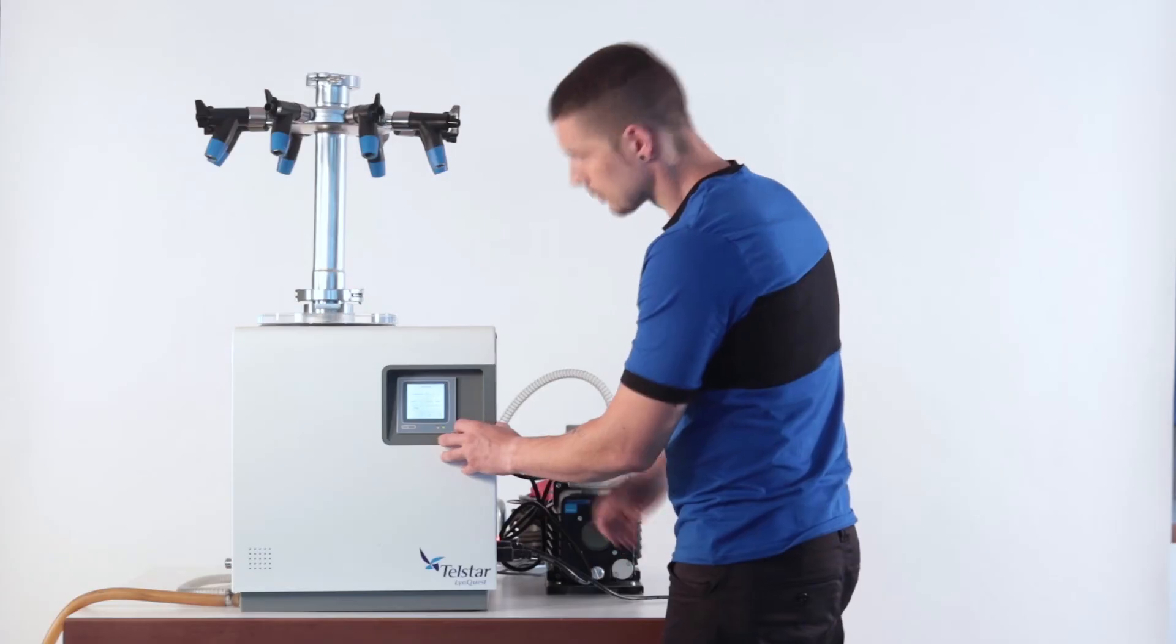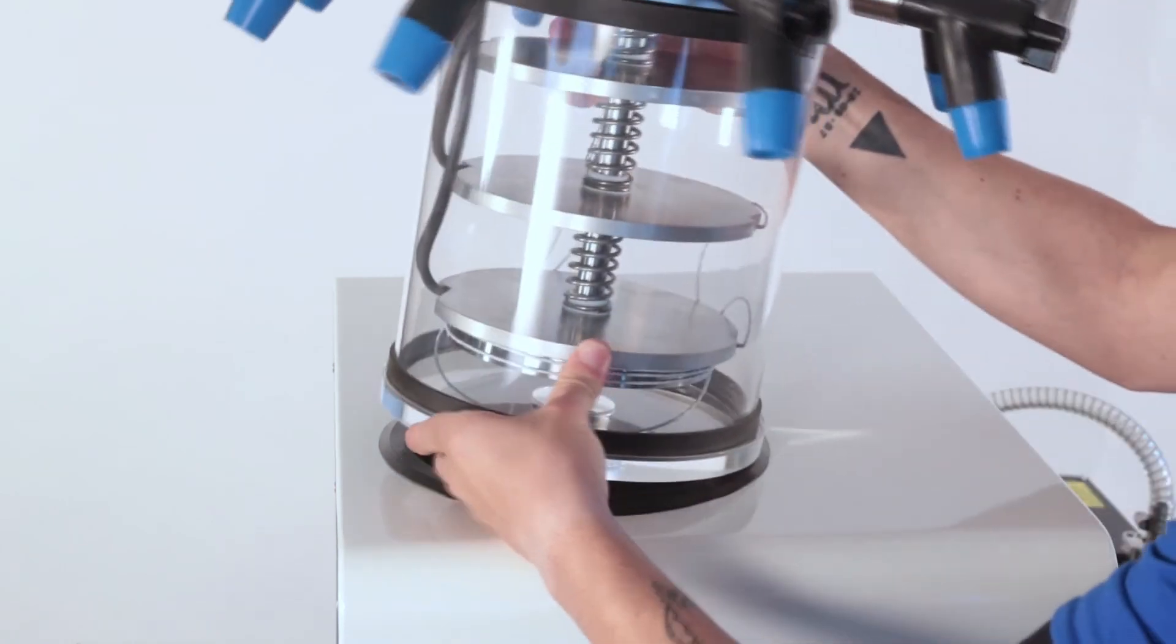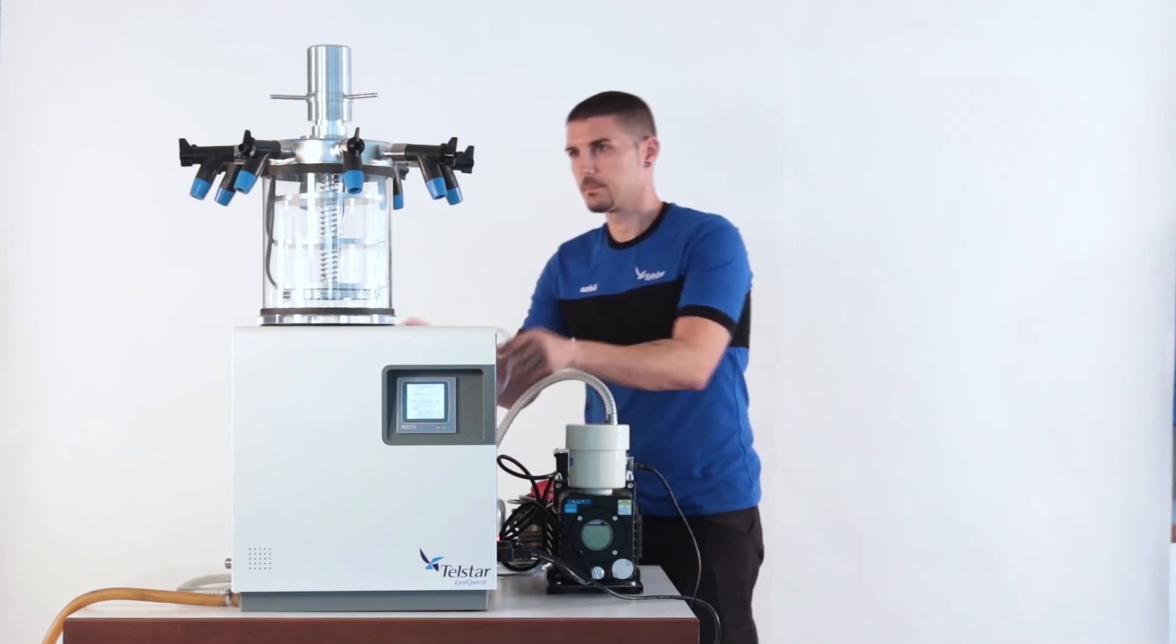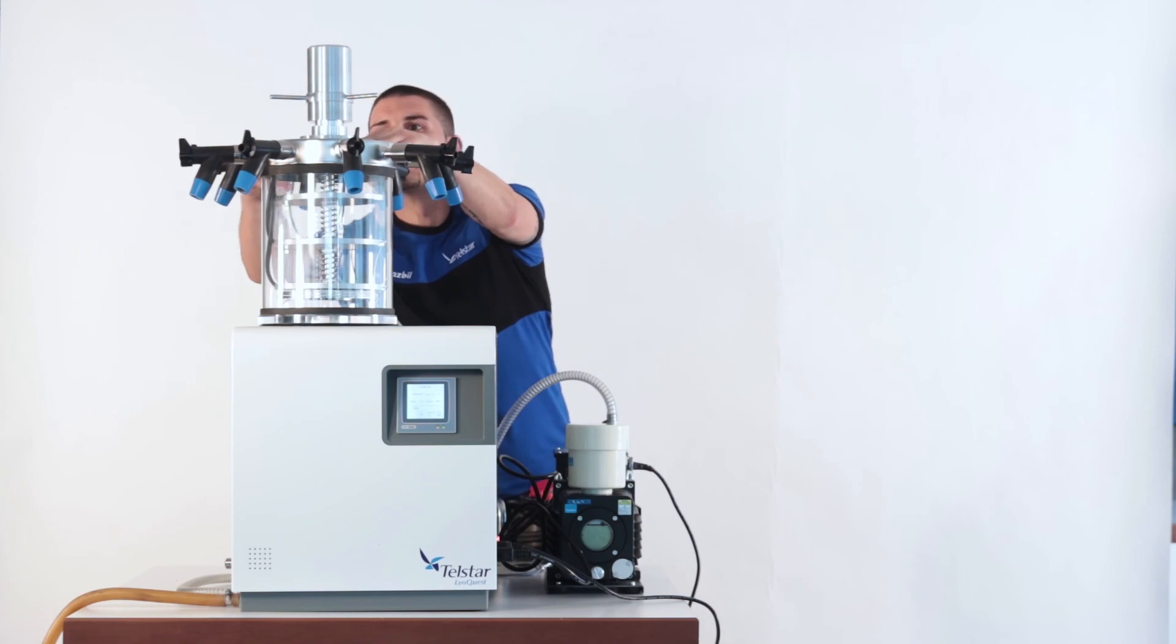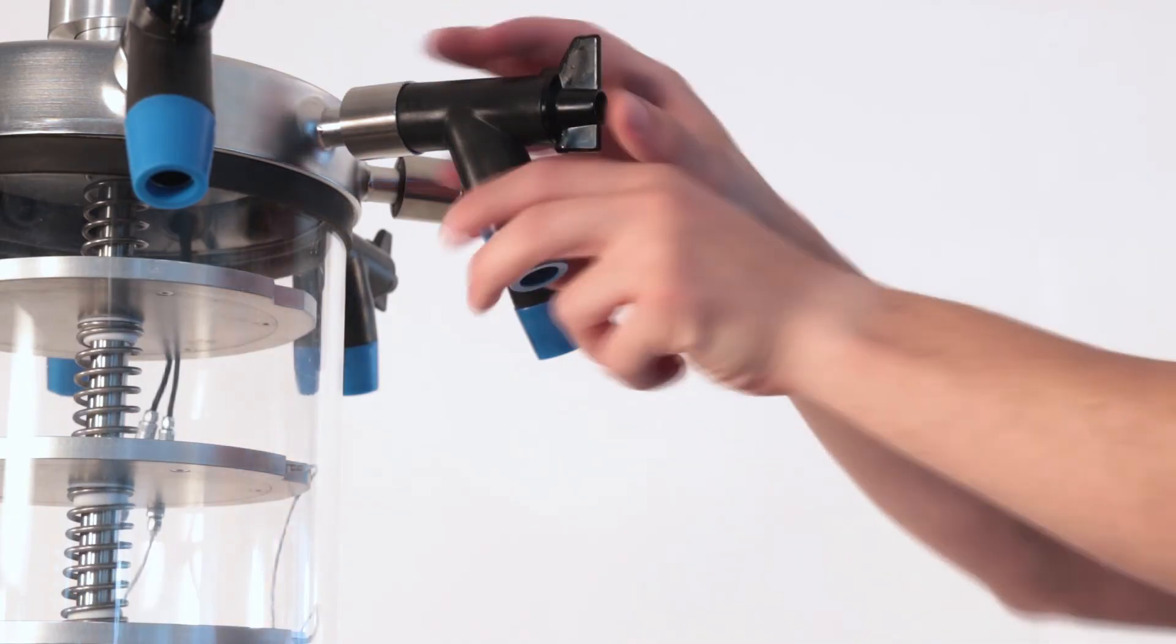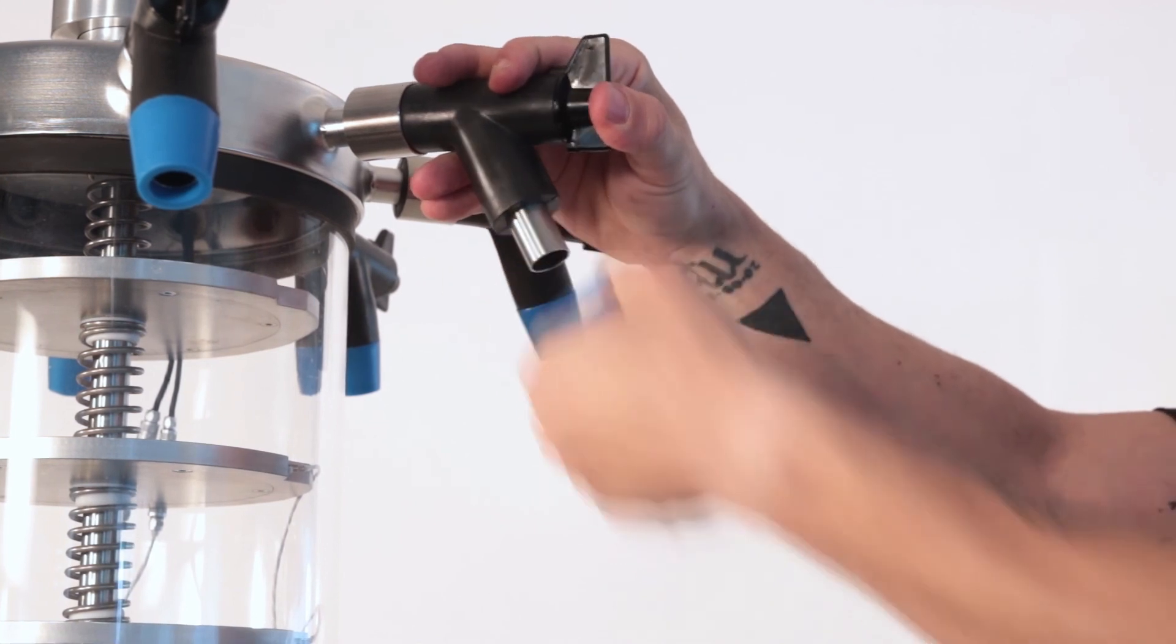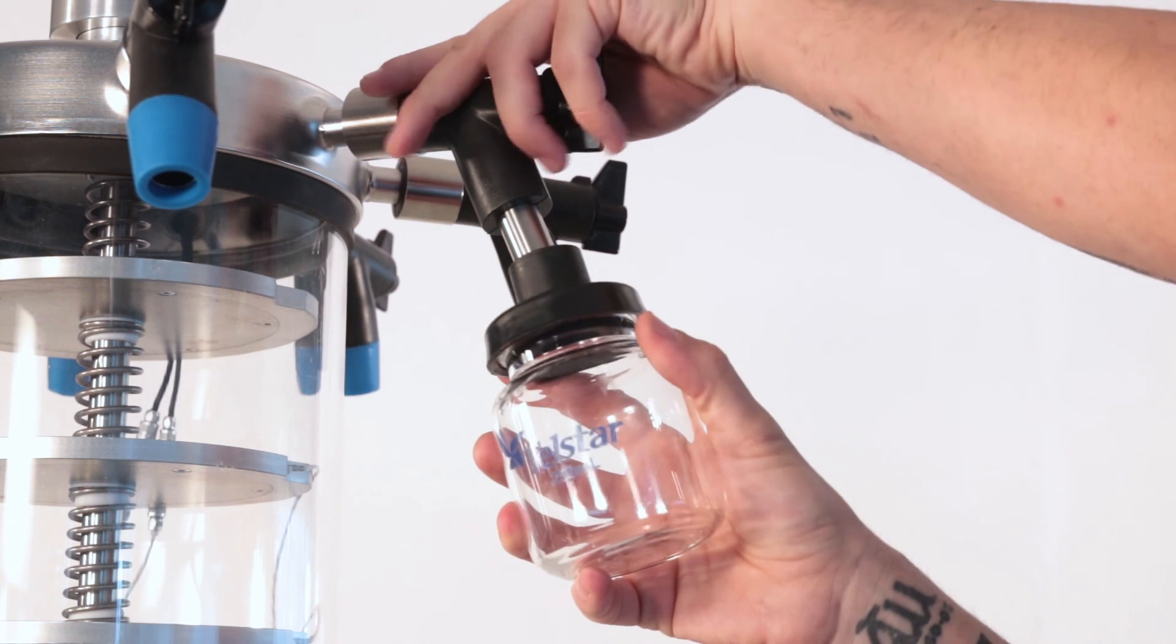8-port manifold. Standard stopper in chamber with 8-port manifold. Telstar can also offer a wide range of flasks and bottles to connect to the manifold, as well as trays and vials for chambers.